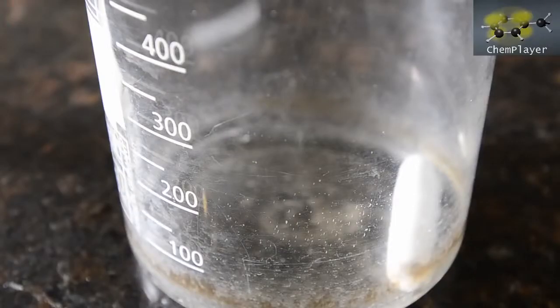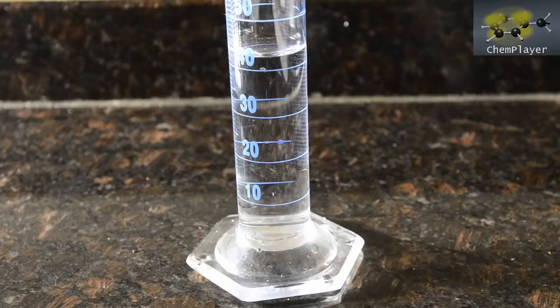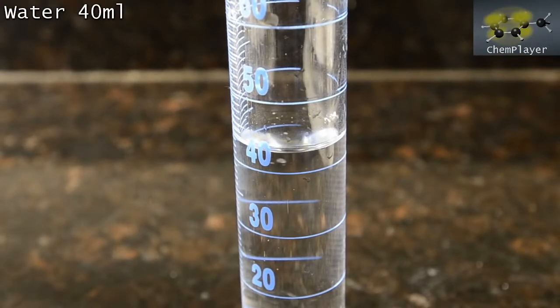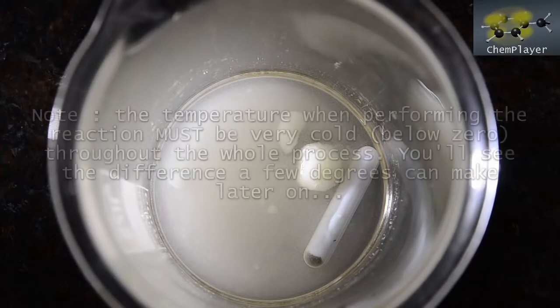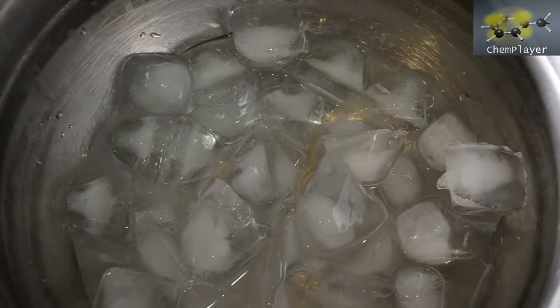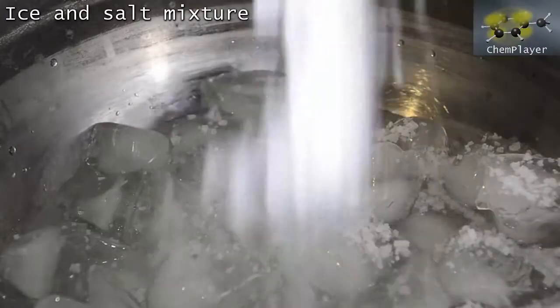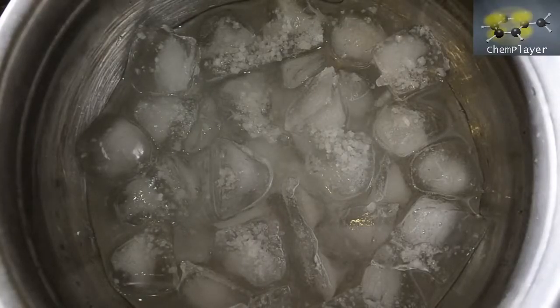First we add the solid 30 grams of sodium nitrite. And the instructions we're using tell us that we need 40 ml of water to start off with, so we measure and add this. It's very important to perform this reaction in the cold, below 0 degrees. So we set up an ice bath. And we added salt to this to get the temperature down even more.